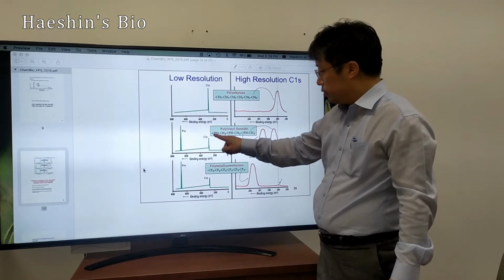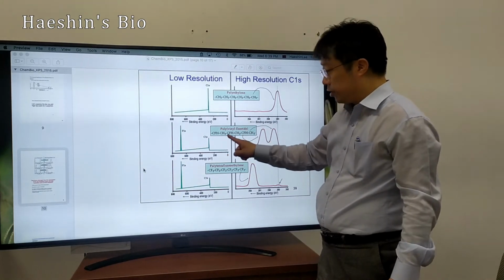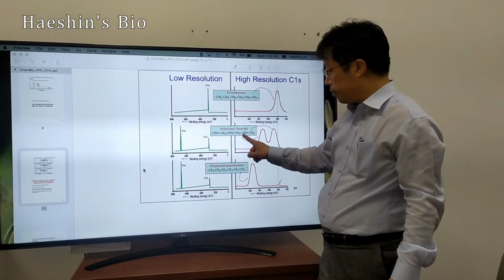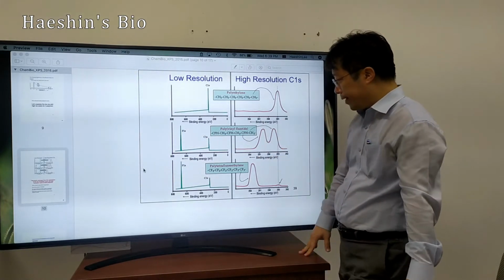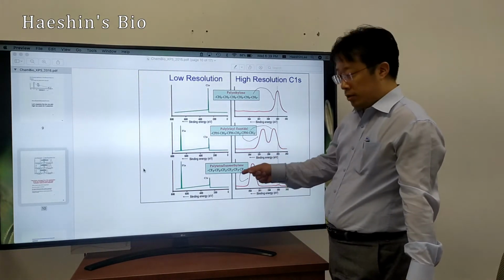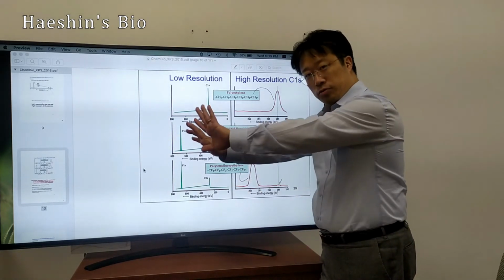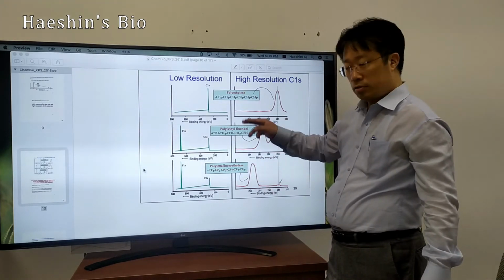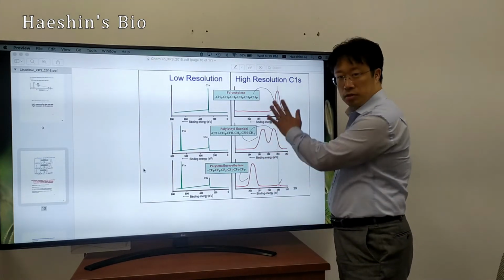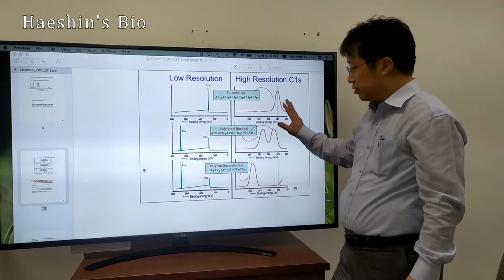So it's 285, higher binding energy, 285. Just 1 to 1. TFE, this tetrafluoroethylene, is all shifted to higher binding energies, or F2, instead of this. So this is a very systematic demonstration for this actual case.